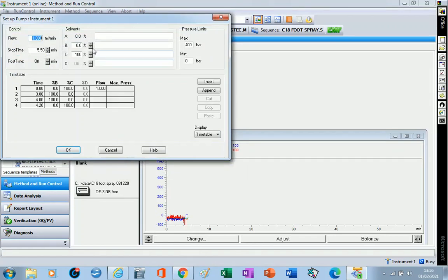And then when you click OK, it shows the pump setup. Here you can change the flow rate. Now because I don't really pump through the column anything and want to save solvent, I just want 0.5 ml per minute. I hope I will not overwrite my method.